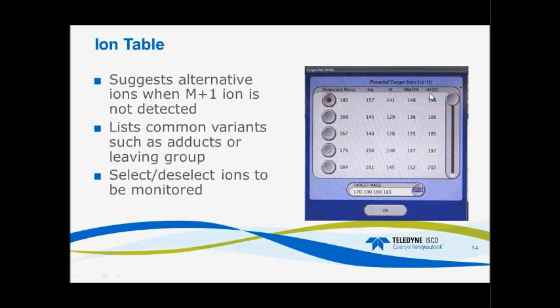A lot of compounds will lose water during the ionization process and rearrange to a more stable compound, because every time you ionize, there's an attempt to reach a stable mass, and so some compounds will cleave off H2O. So if I detected 180, but my compound possibly rearranged to lose water, then my M+1 with the water would be 198.